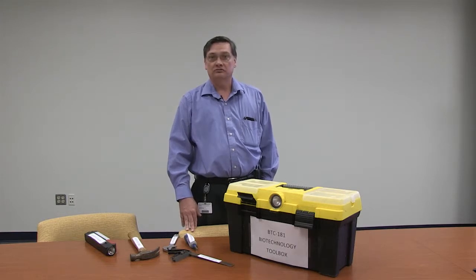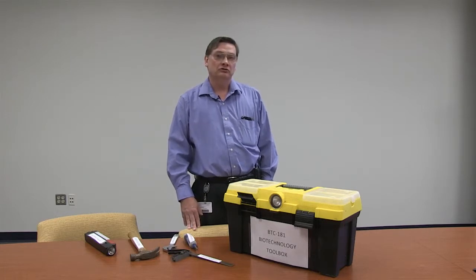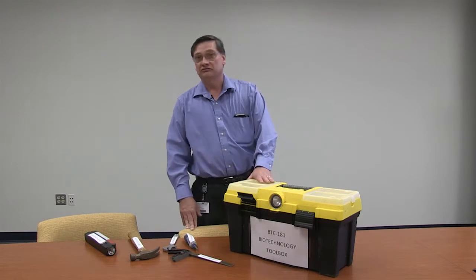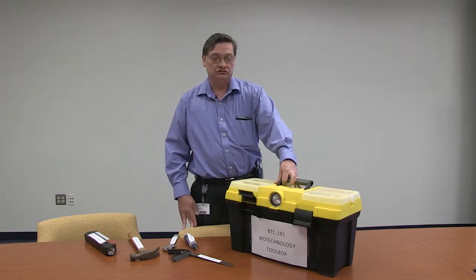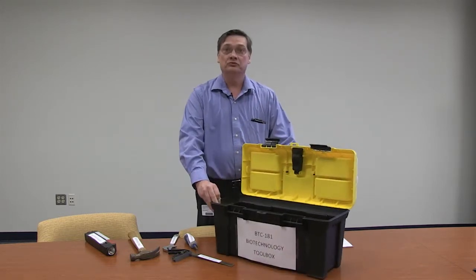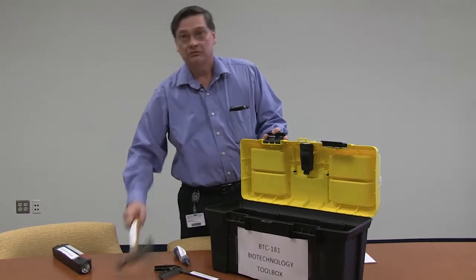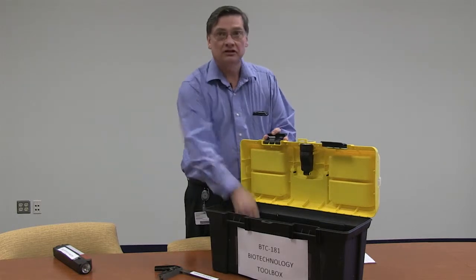The content of the course, Basic Lab Techniques, is pretty much as the name implies. You're going to be learning the basic skills that are necessary to work in a biotechnology laboratory. I'd like to use an analogy of this toolbox here — the BTC 181 Biotechnology Toolbox. When the student comes in, we assume they're coming with an empty toolbox. Through the course of the semester, you're going to be accumulating tools: centrifugation, making buffer solutions, doing electrophoresis.